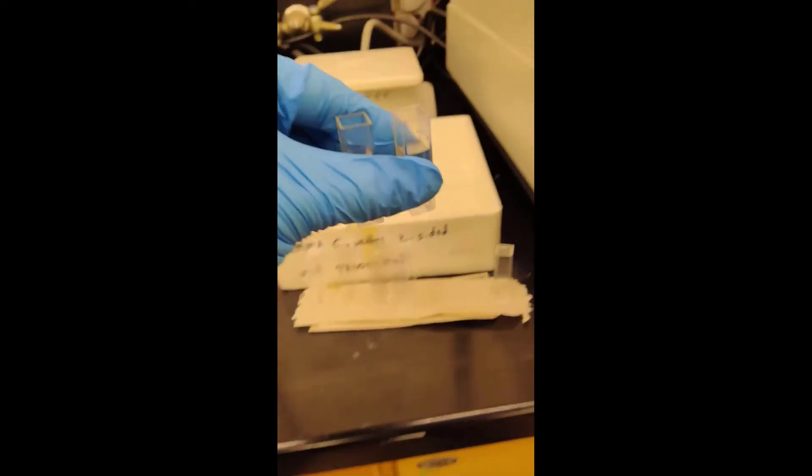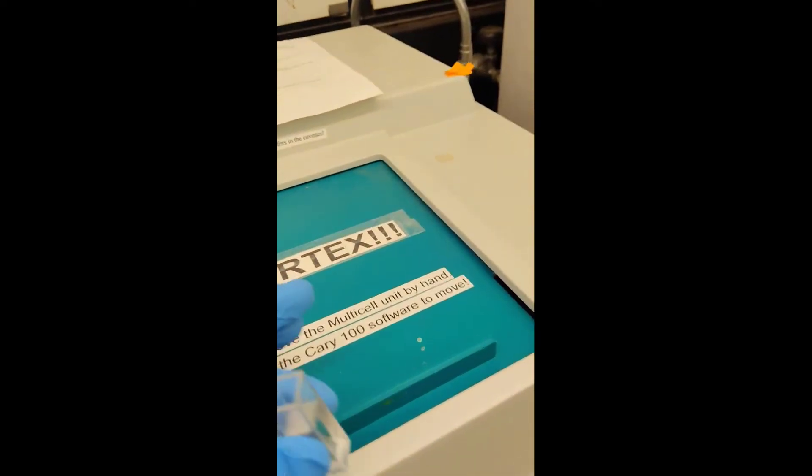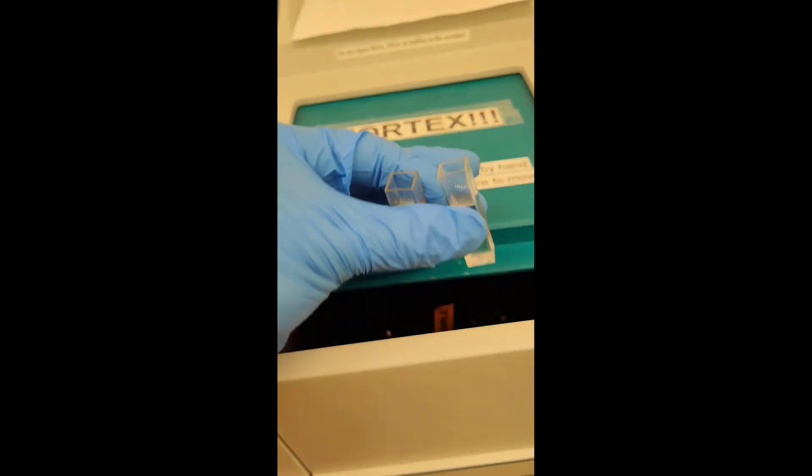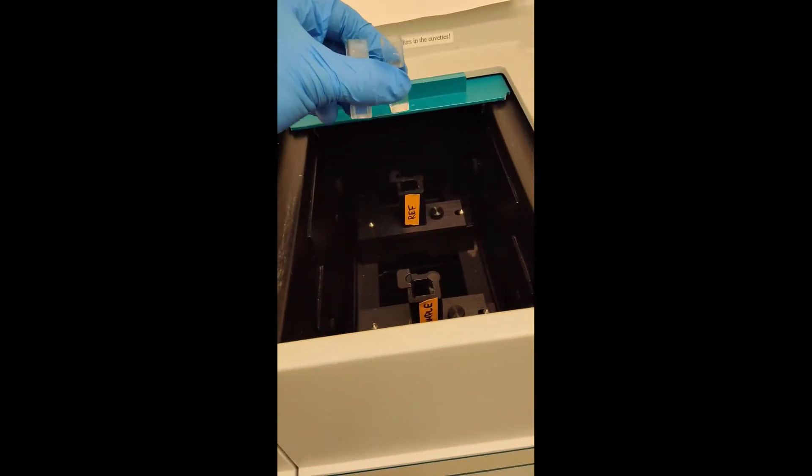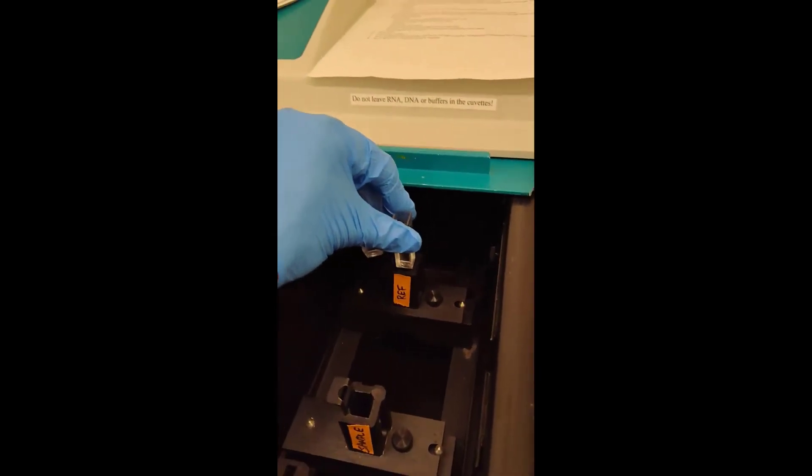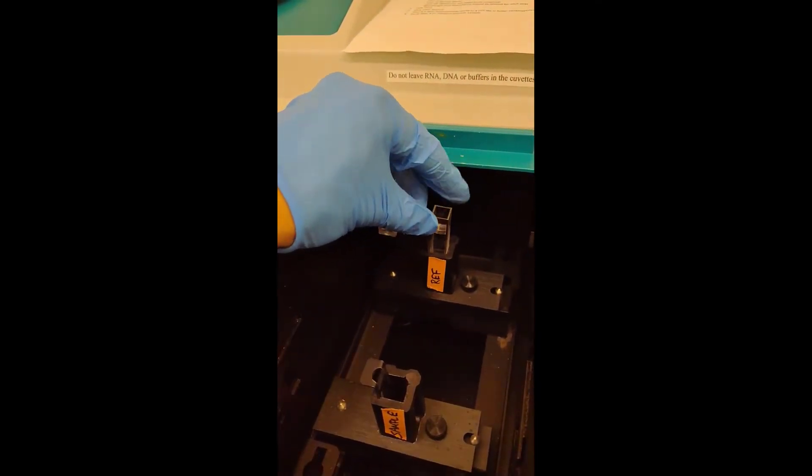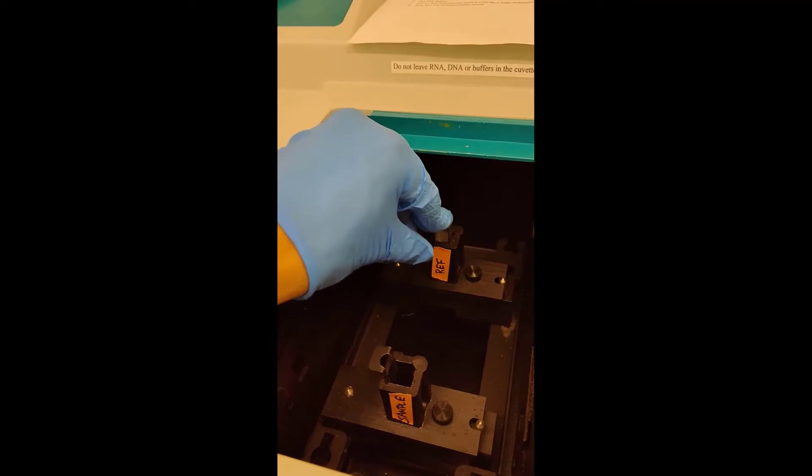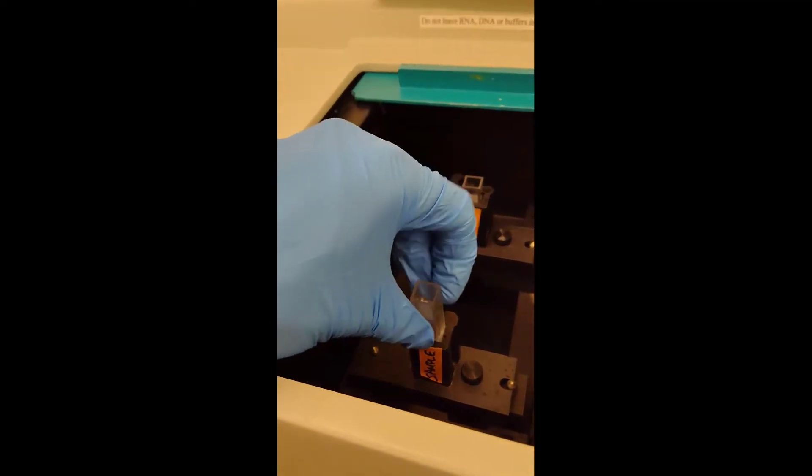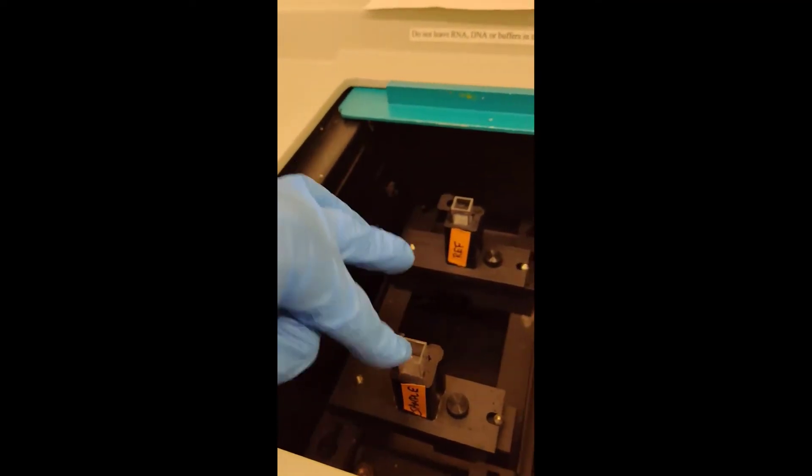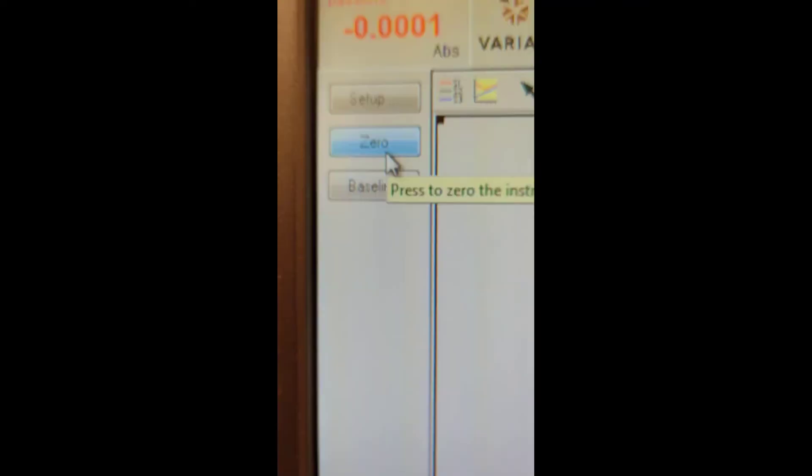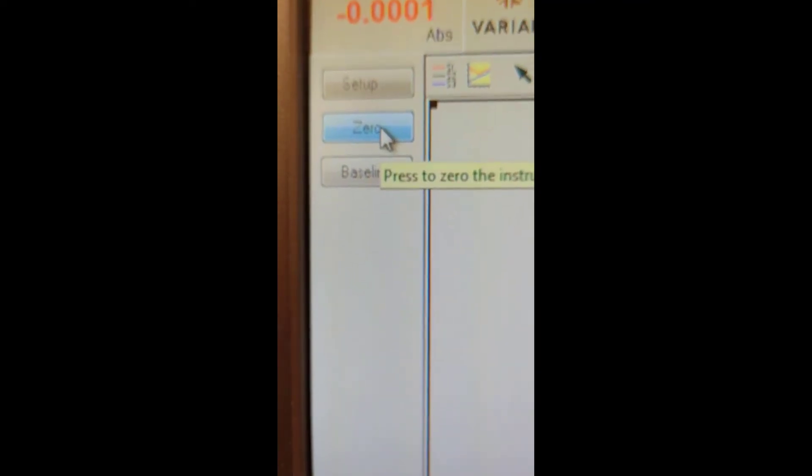Once that's taken care of, I'm going to load both of them into the two different cell compartments. I'll put one in the reference compartment, making sure that the transparent sides are facing horizontal to me, such that the light can pass through. Same thing with the sample compartment. Close that up, and then I can go ahead and zero the instrument.